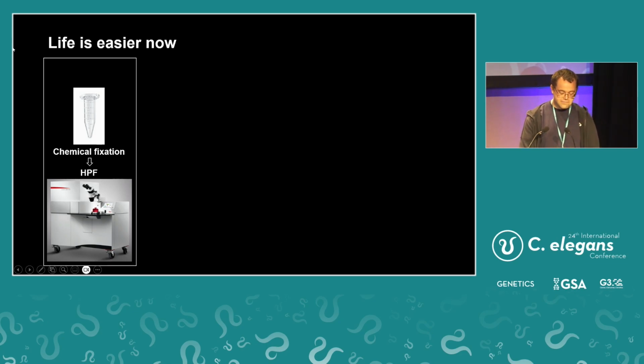So Mia just gave this great intro to high-pressure freezing. So we can get a really nice sample that's fixed in a way that is as close to the native ultrastructure as possible. So things are much clearer when we try and look at them.